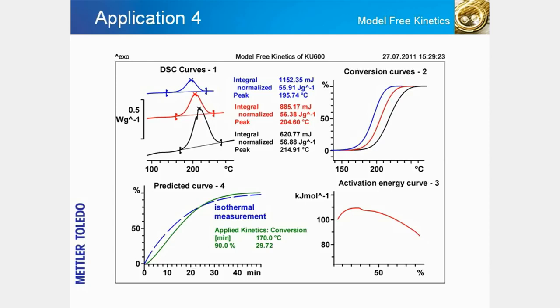Kinetic analysis is used to study the rate at which a reaction proceeds. The slide summarizes the steps involved in kinetics analysis using the so-called model-free kinetics, or MFK procedure. The method is based on the measurement of several dynamic DSC measurements.